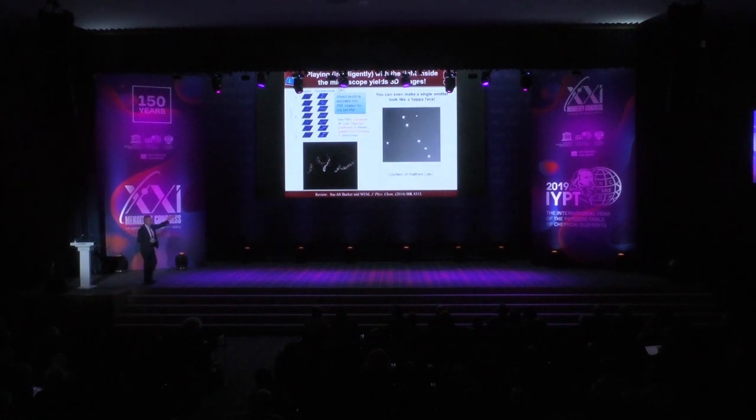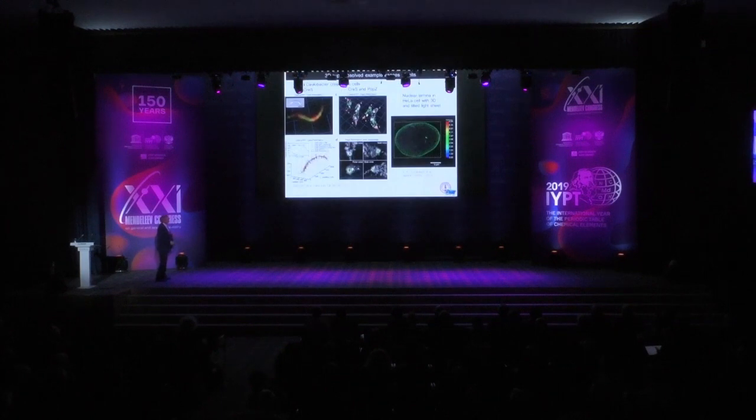So these single molecules turn into a happy face, and then as you move above and below the focal plane, they turn into an unhappy face. Like my face right now.